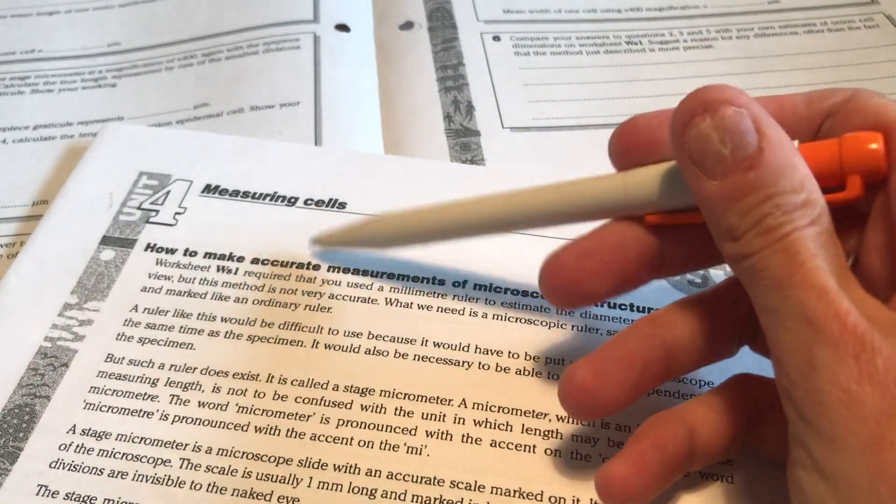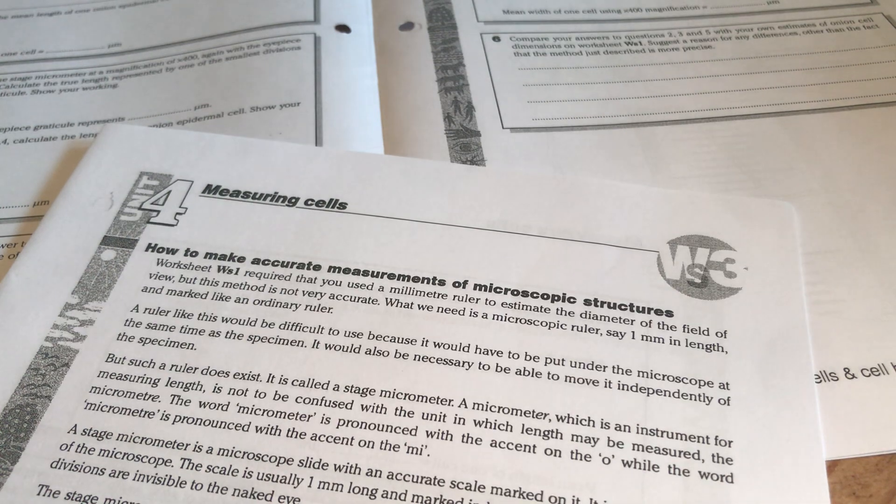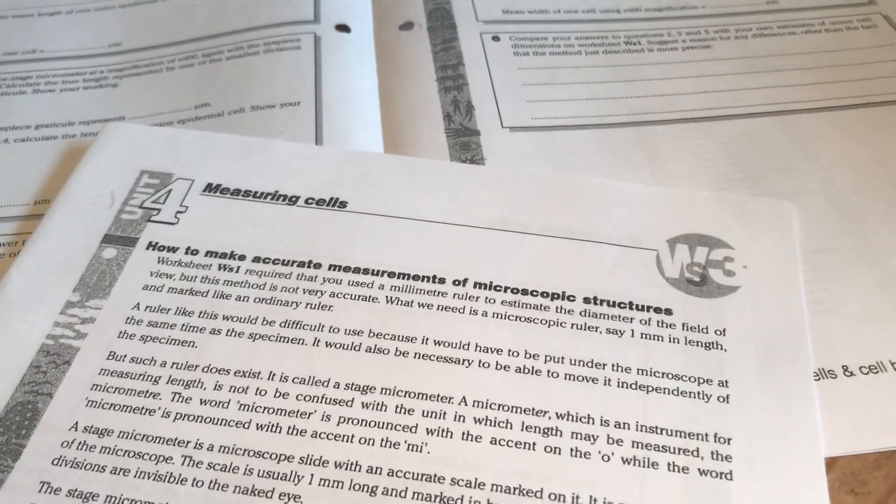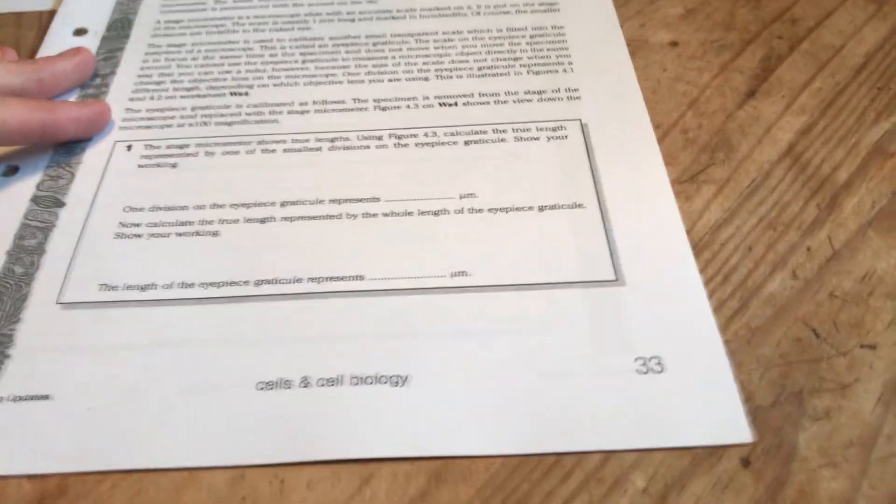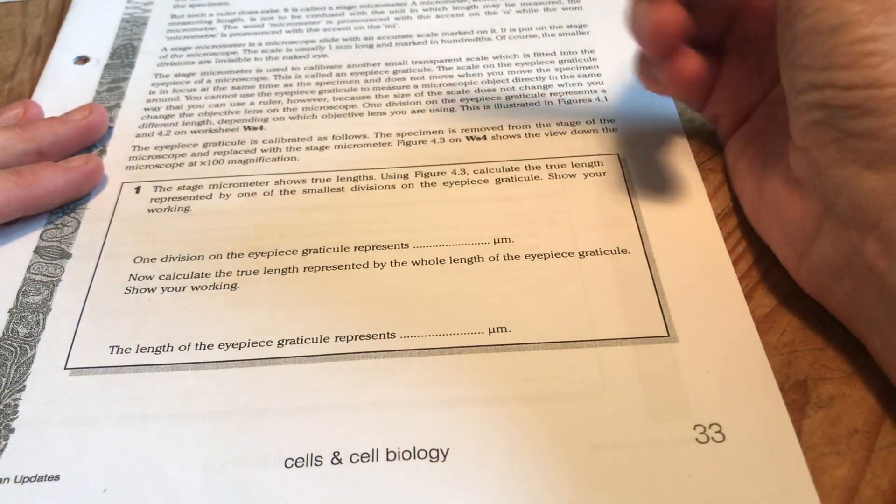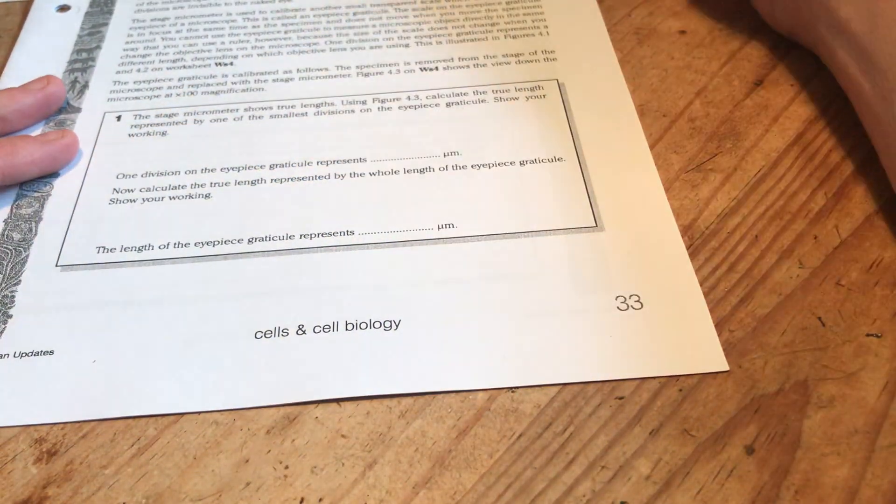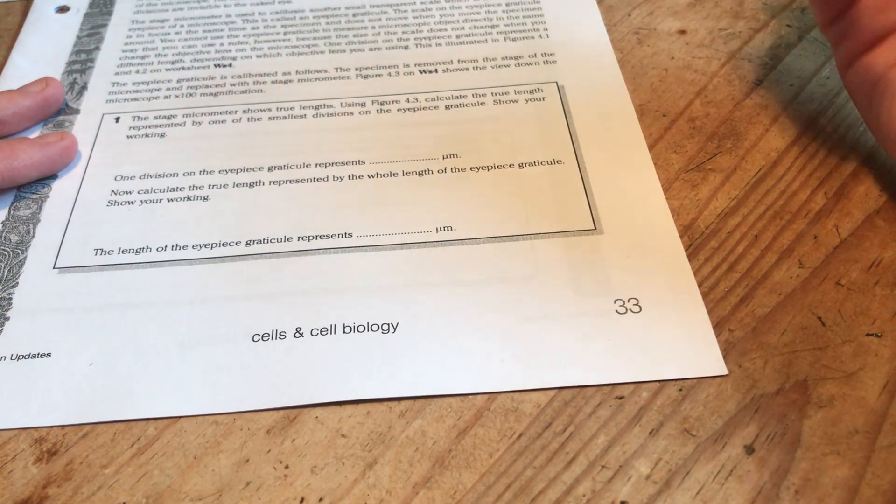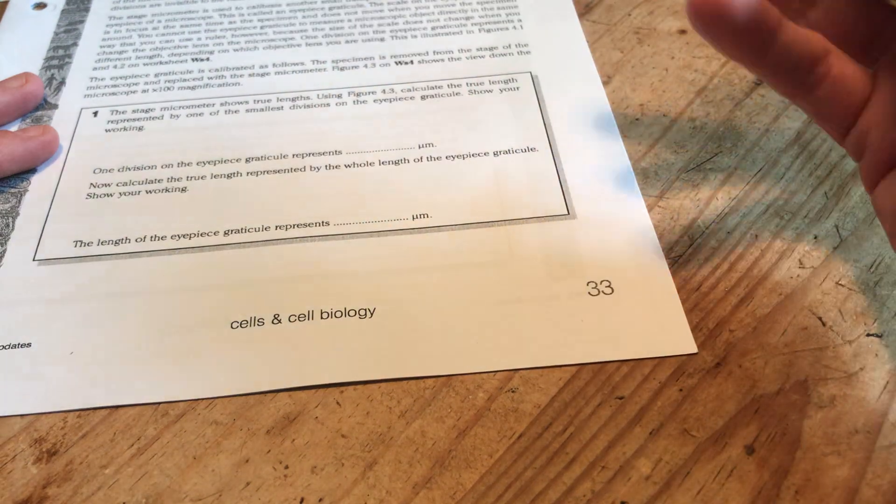This is a little video to take you through how to complete the measuring cells worksheet about using stage micrometers and eyepiece graticules. So if you want a spare copy of the sheet just print one out off the task. You've got some notes here explaining how stage micrometers and eyepiece graticules work and you've got them in your lab book as well.